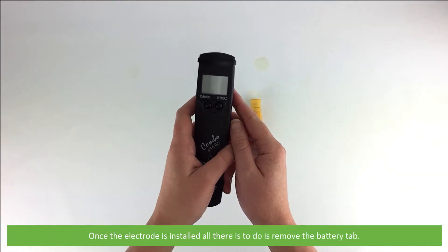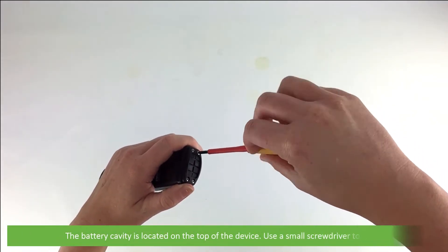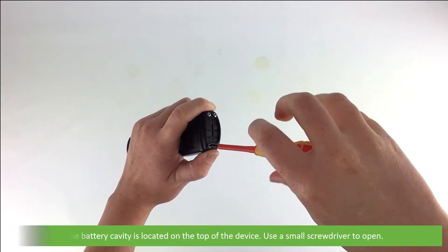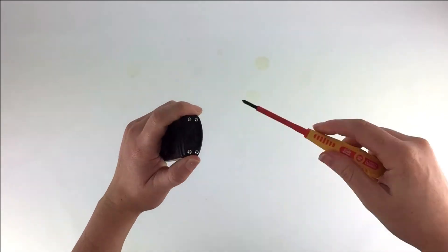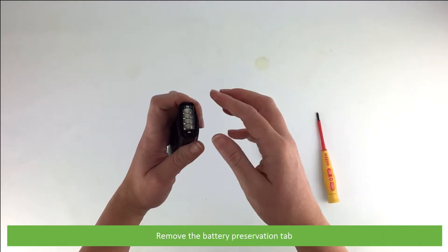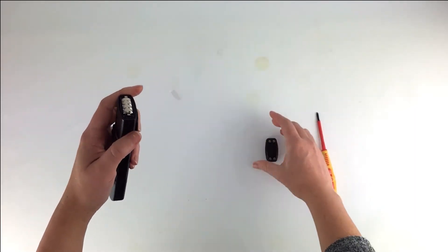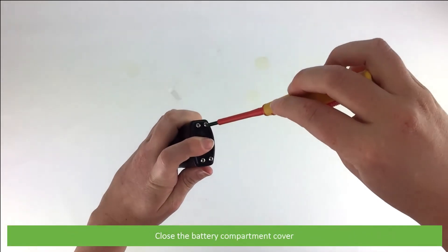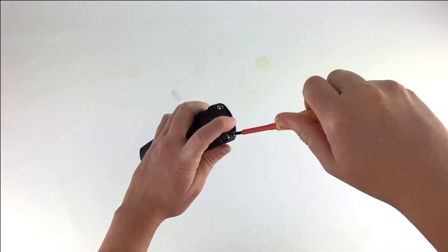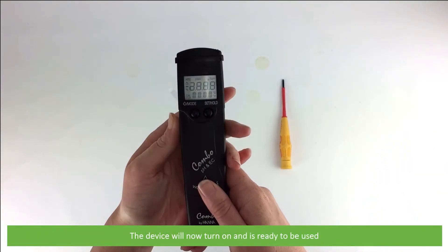Once the electrode is installed, all there is to do is remove the battery tab. The battery cavity is located on the top of the device — use a small screwdriver to open it. Remove the battery preservation tab, then close the battery compartment cover. The device will now turn on and is ready to be used.